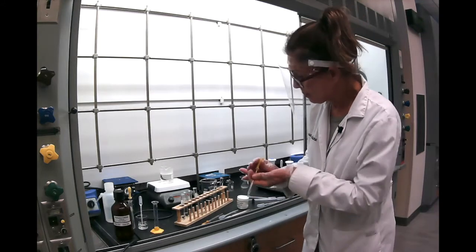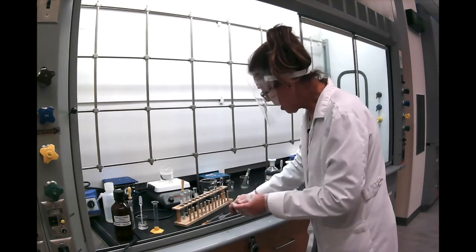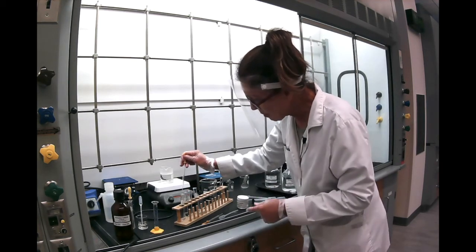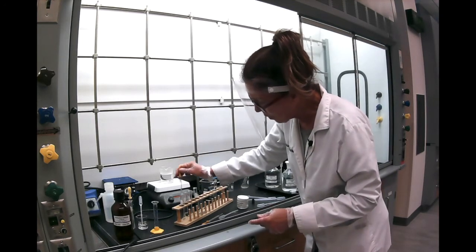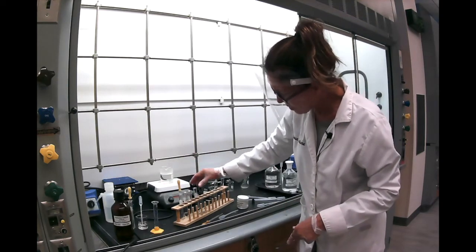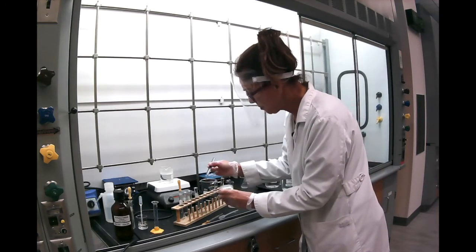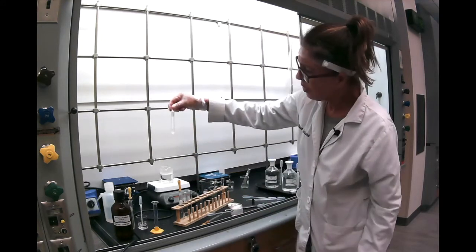glass pipette. So pipette it out into a clean, dry test tube. And the reason I'm doing this is to make sure that the water on the sides of this test tube doesn't stay on my substance. Now I'm going to put a little bit of the drying agent, which in this case is sodium sulfate. And you shake it a little bit.